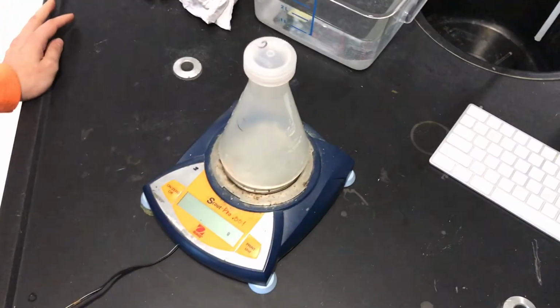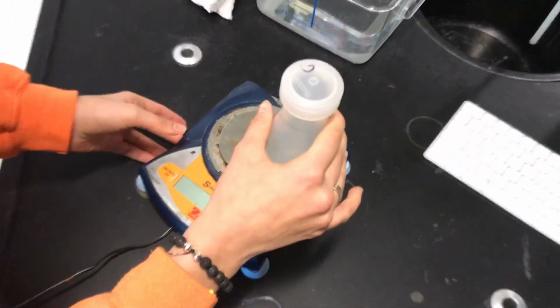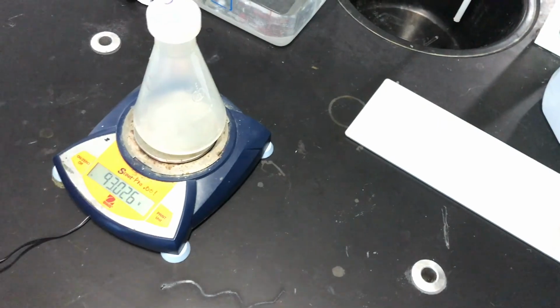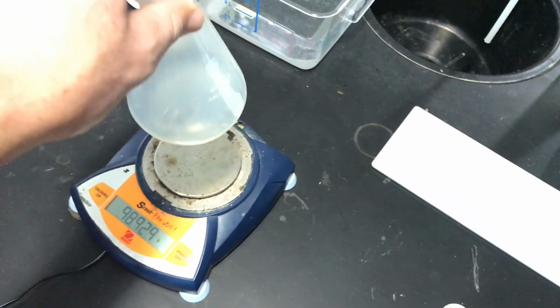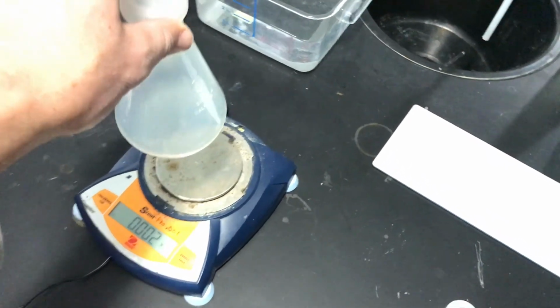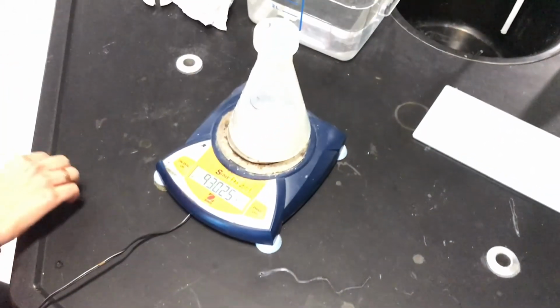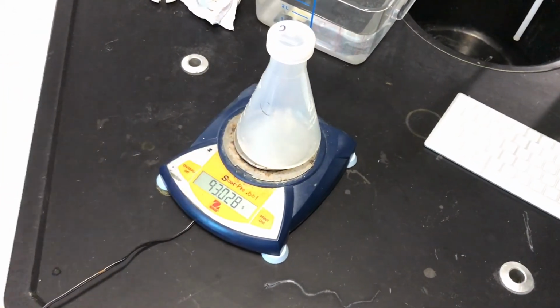And let's see what you get over here. I'm just going to get around student L. Oh yeah, let it zero out first. Did you zero it out first? Yeah. Okay, let's make sure. Make sure it goes to zero first. Okay, good enough. Good job. So now you got 93.025.